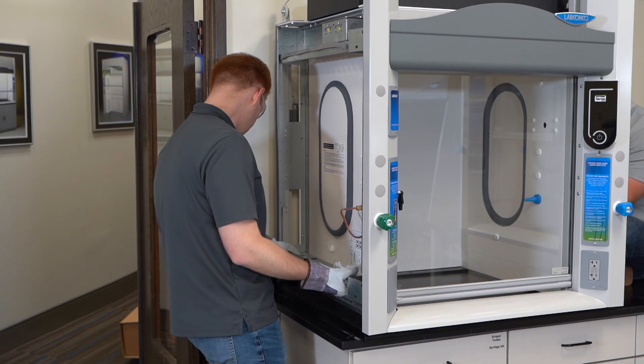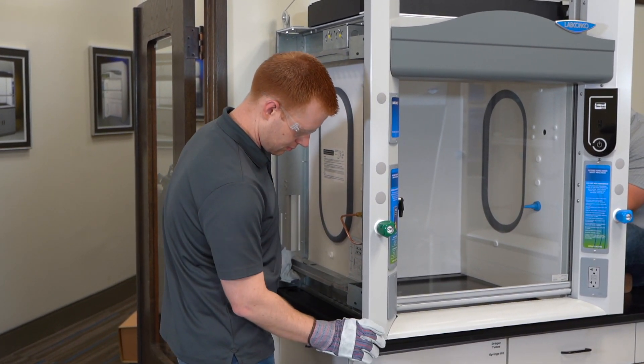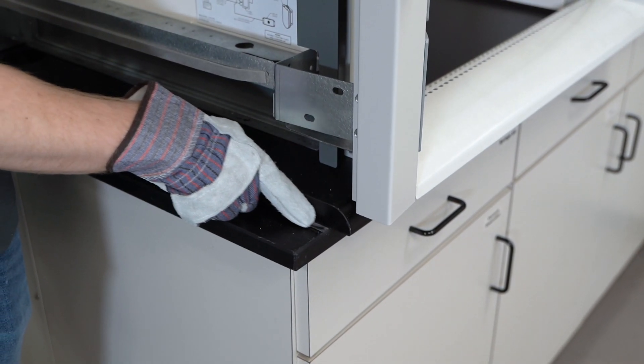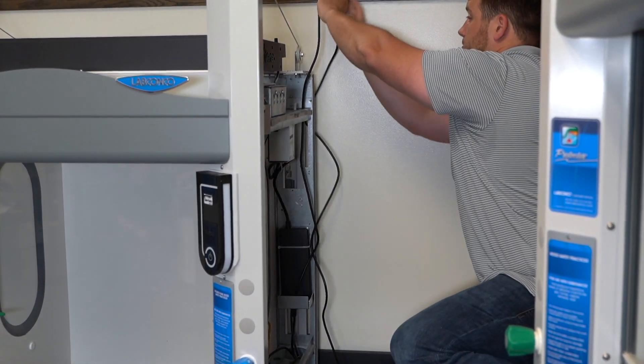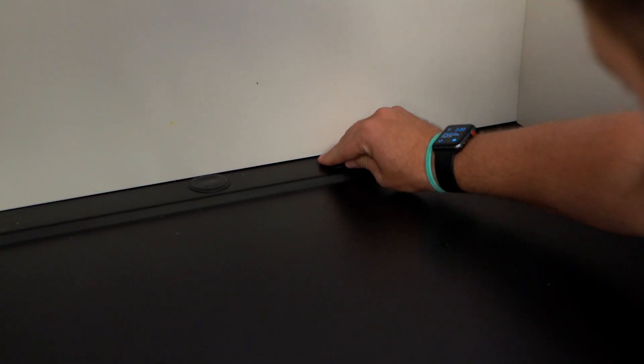Now set the unit in place. Ensure that the back of the hood is flush with the back of the work surface — this aligns the hood properly to project past the front of the work surface 1.7 inches. Make sure the power cord can reach an appropriate outlet, but you don't need to plug it in yet. Plug vent holes or install your vent kit, which comes with its own instructions.